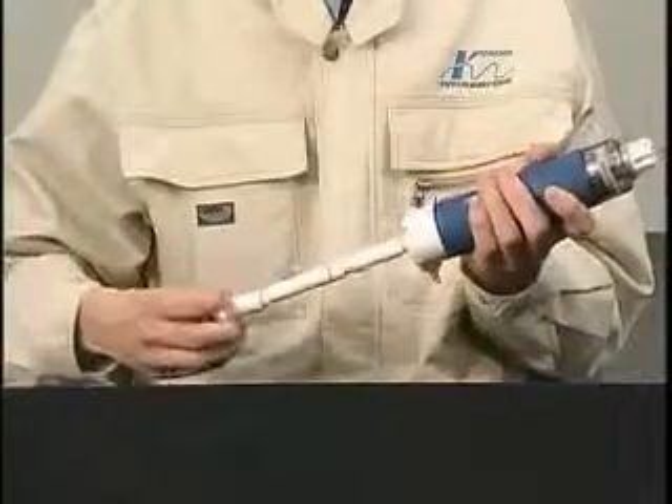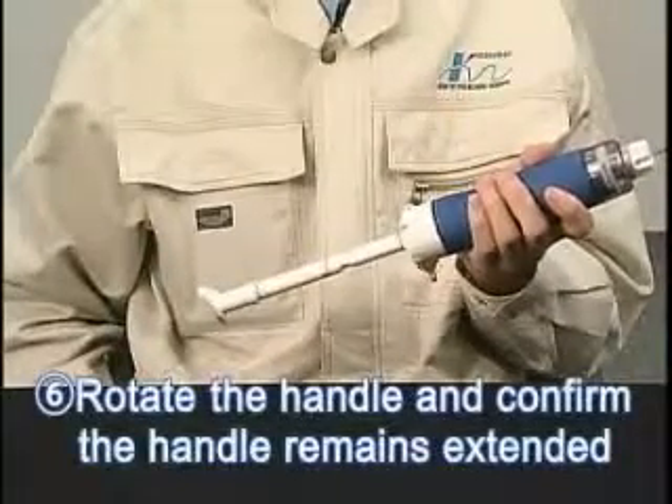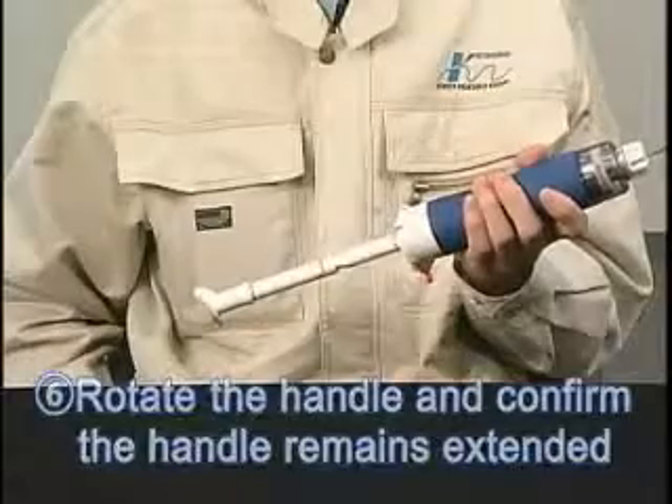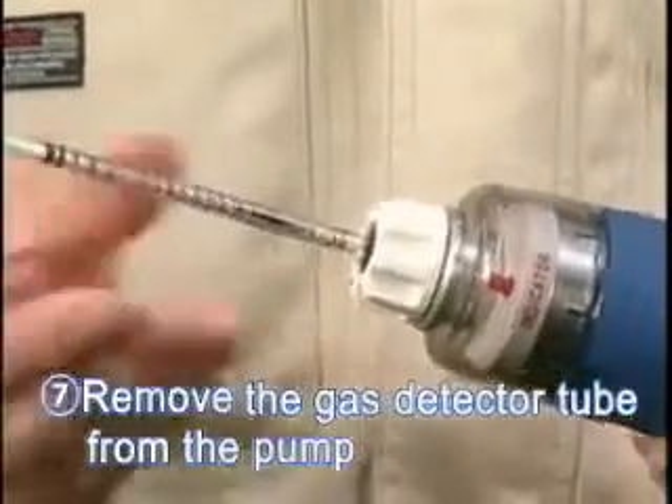After the sampling is completed, turn the handle 90 degrees clockwise or counterclockwise to unlock the handle. Confirm that the handle remains fully extended. Remove the detector tube from the pump.